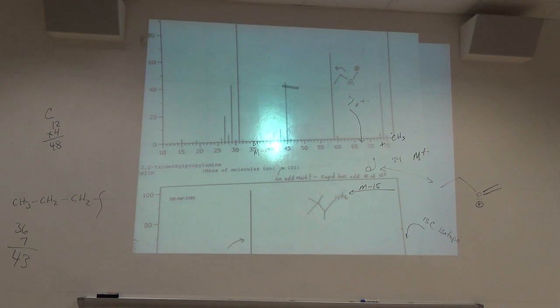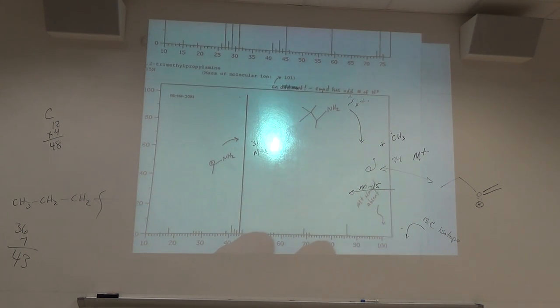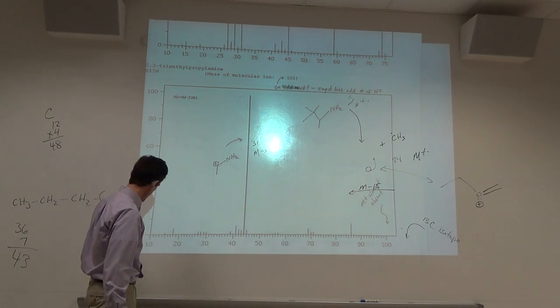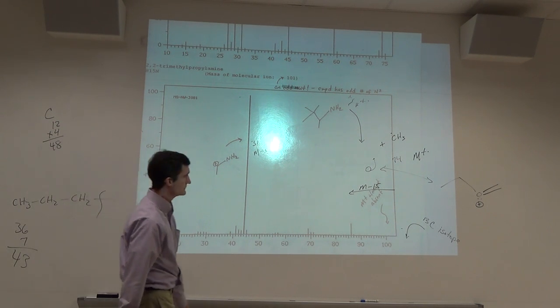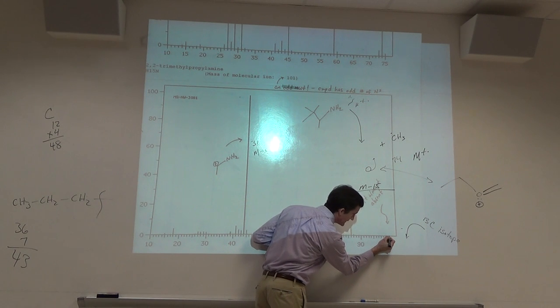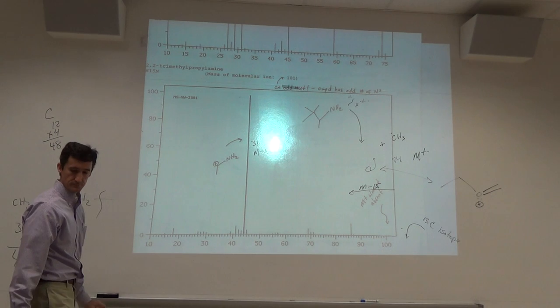Let's look down below. Here's an amine, a primary amine. Well, this is a nice clean mass spec. It looks like one predominant cleavage peak. Molecular weight is 101. Molecular ion is absent, or it's very minor. It looks like there's a little something, maybe, but it's pretty much absent, yeah?